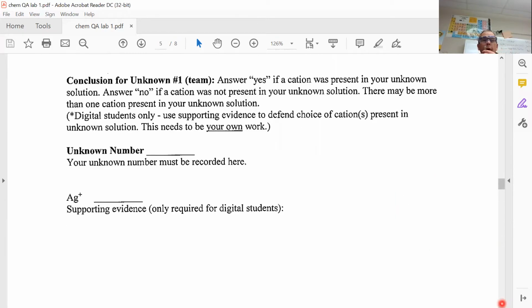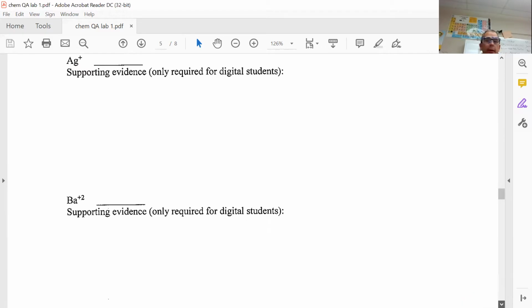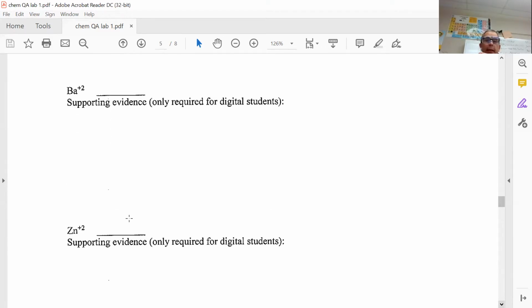Ultimately, you're going to go to your unknown and answer for this unknown, letter E, Ag, yes or no. If it's present, same thing for Ba, yes or no, and Zn, yes or no. You are going to use the supporting evidence to support that, and that is in the general information video that I put out for unknowns, so make sure to watch that one.